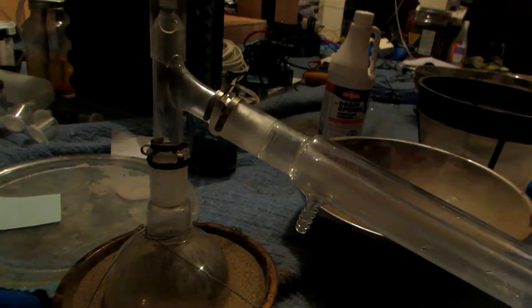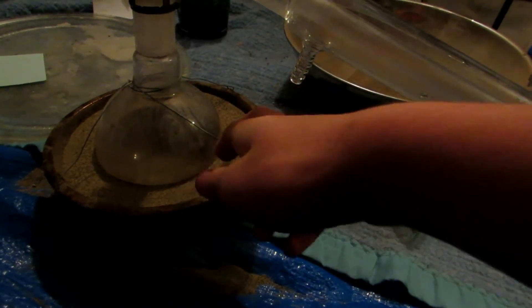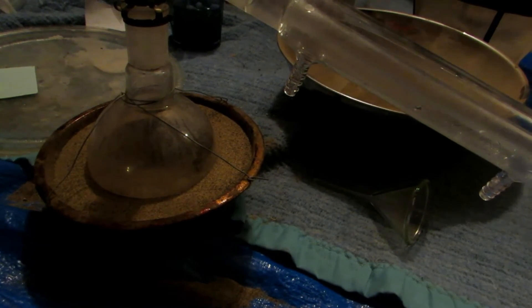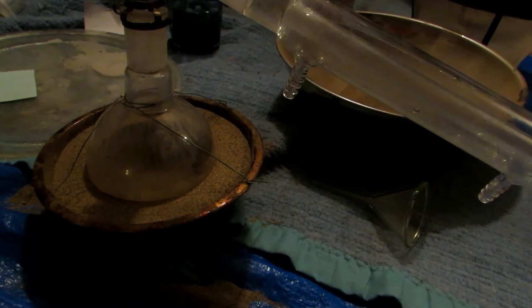Before I took this outside I just wanted to show you a quick dilemma I had. We've set up our sand bath and everything, and I've fastened the flask with wires in case there's bumping, so it doesn't start jittering out of the sand bath. It's held in place quite firmly.